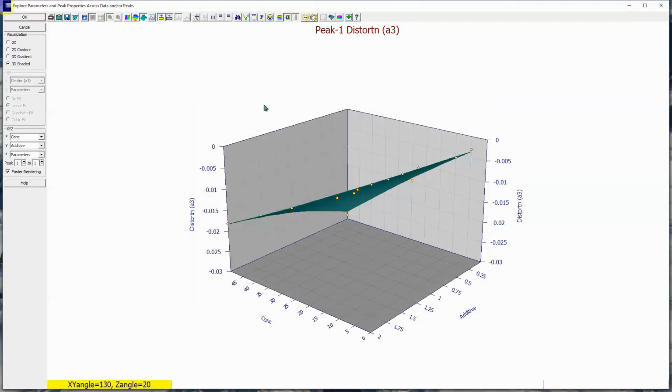And we're doing this because these higher parameters, which are the higher moment parameter and the IRF parameters, which are shared, tend to be noisier, and you'll see trends easier if everything is smoothed.